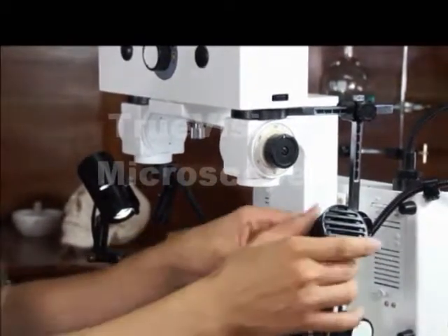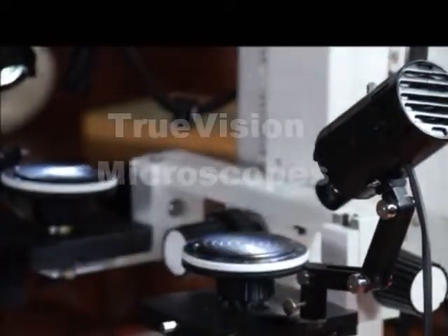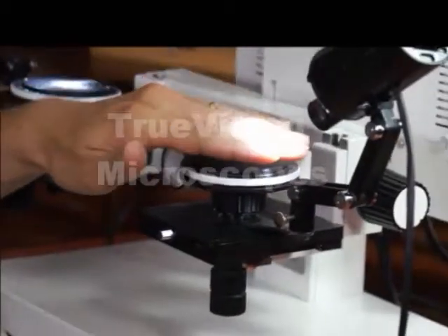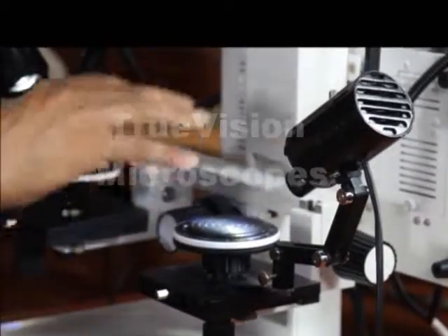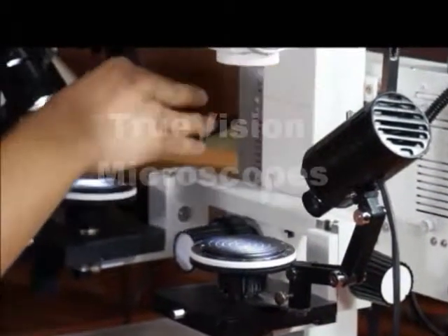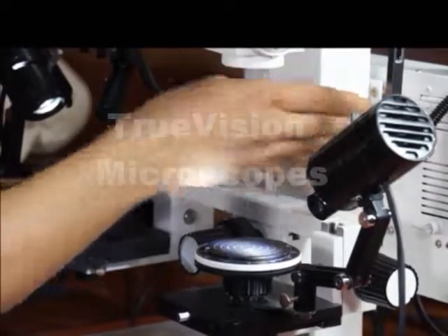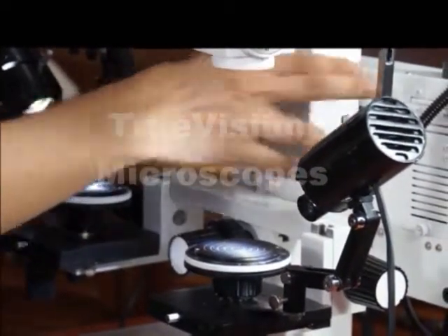One thing to note: these LED illumination sources are only 5 watts, but they're very bright and will cover most of what you need. When you really need much better illumination, you can use the more powerful 150-watt illuminators on the back fiber optic.